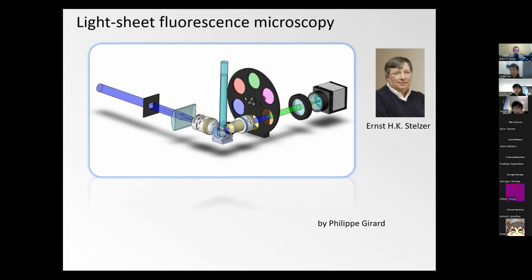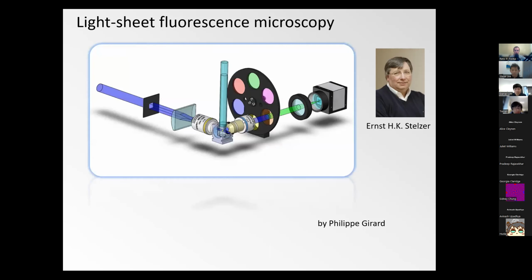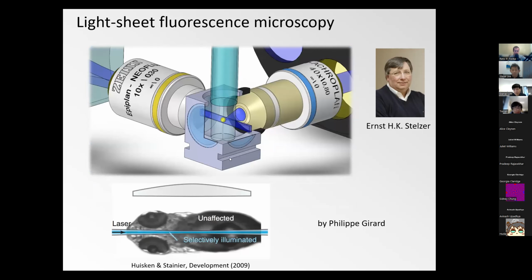And if you look, what's the trick of the Lightsheet microscope? Somewhere here, this capillary is the sample. So if you zoom in, the idea is basically that with one objective, you create a sheet of light that illuminates this sample here in yellow, and it illuminates a slice of it, and that excited slice is then imaged with a second objective onto a scientific camera. In principle, very simple, or at least in that form.